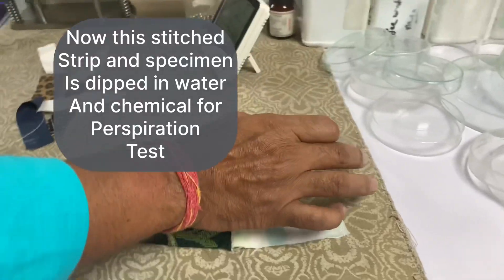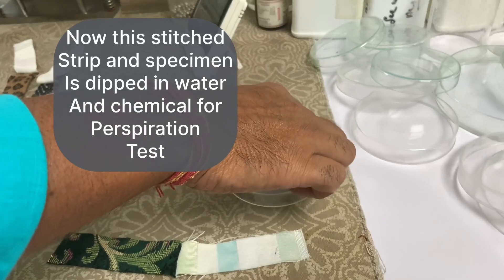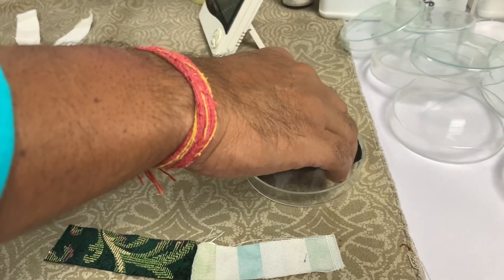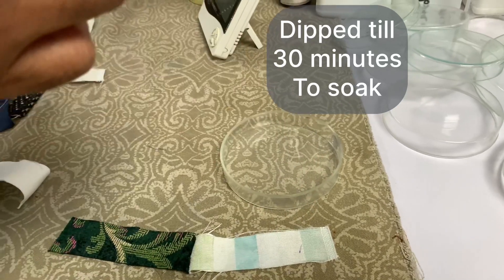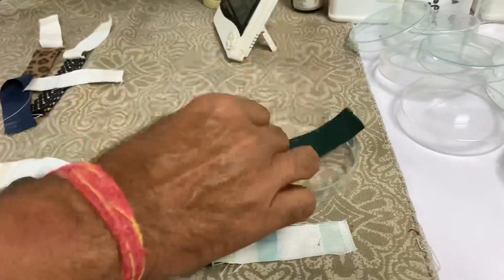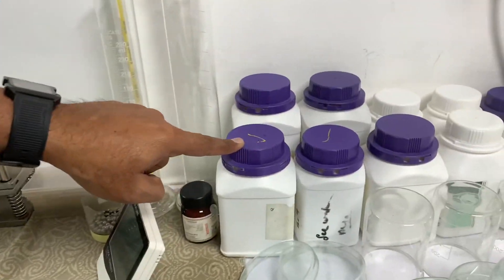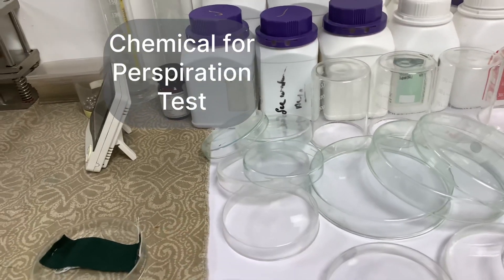Now we need to dip this strip and specimen in water, and for the perspiration test we use a chemical. This dipping will be for 30 minutes for both tests so that it soaks the water and chemical properly. This is the chemical for the perspiration test.